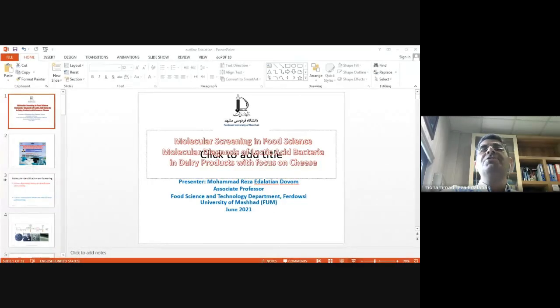Culturing means culture-dependent molecular techniques, which start with dilutions, after that plating in some kind of selective or elective media for lactic acid bacteria, because here we focus on lactic acid bacteria and we want to isolate lactic acid bacteria from the cheese samples. So we should use selective media for lactic acid bacteria like M17, MRS, KAA, and MRS vancomycin.